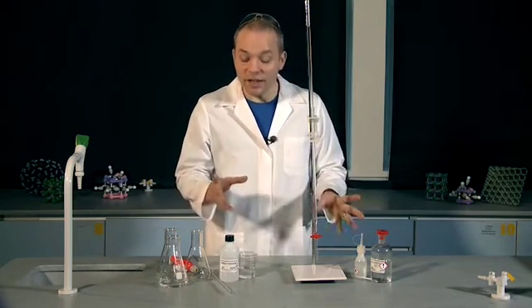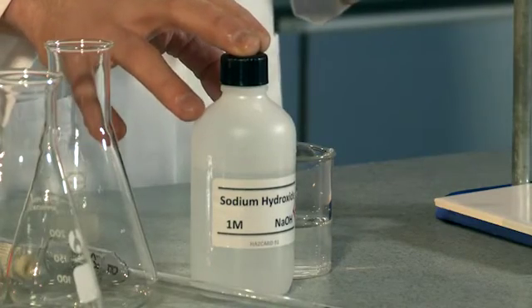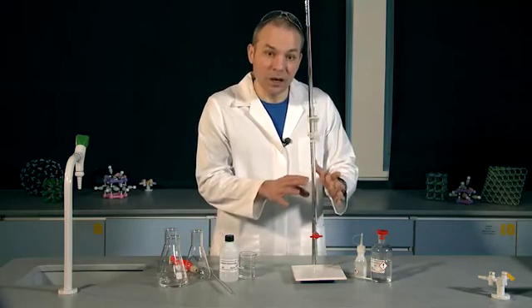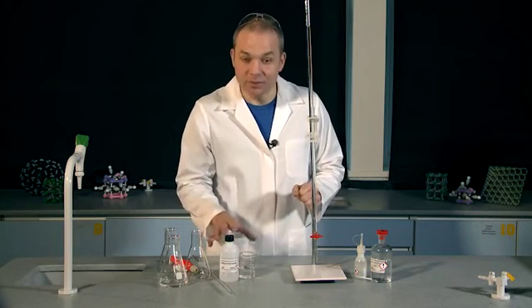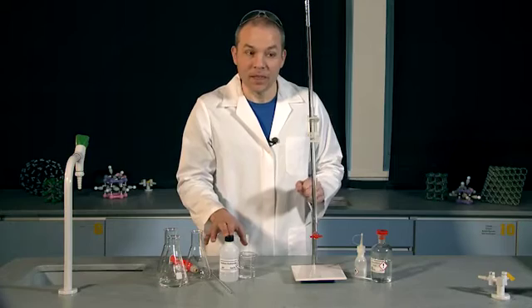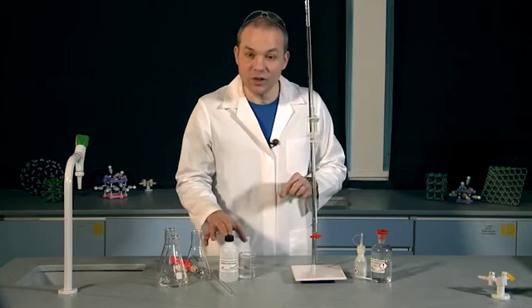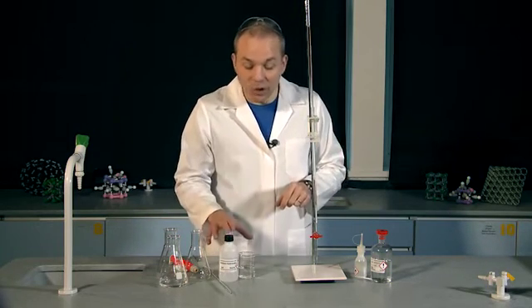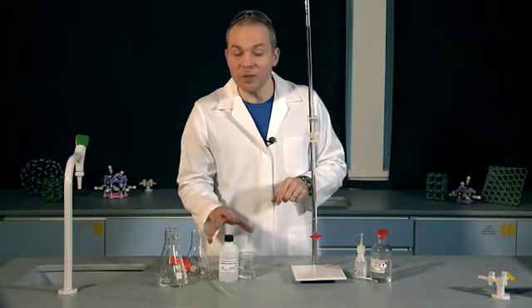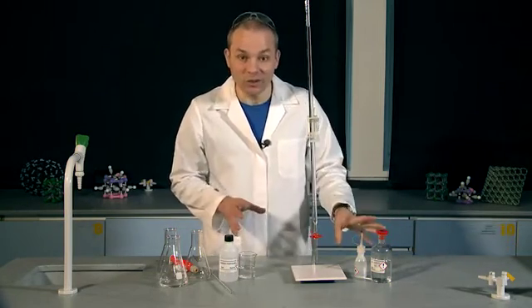During a titration, I can measure a fixed volume of my sodium hydroxide solution and then add my hydrochloric acid solution until I exactly neutralise my sodium hydroxide. If I measure the volume of hydrochloric acid needed to neutralise my sodium hydroxide, then along with that volume and the volume and concentration of my sodium hydroxide solution, I can work out the concentration of my hydrochloric acid.